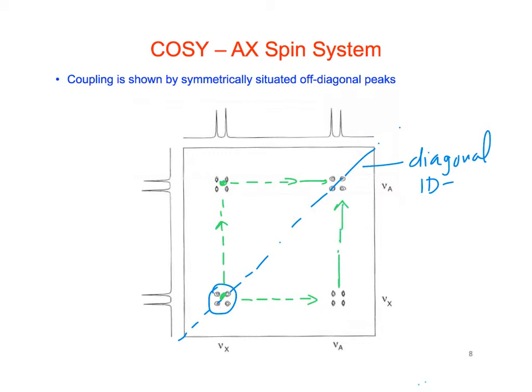Okay, so we observe coupling by symmetrically situated off-diagonal peaks. Notice that those are symmetrical.